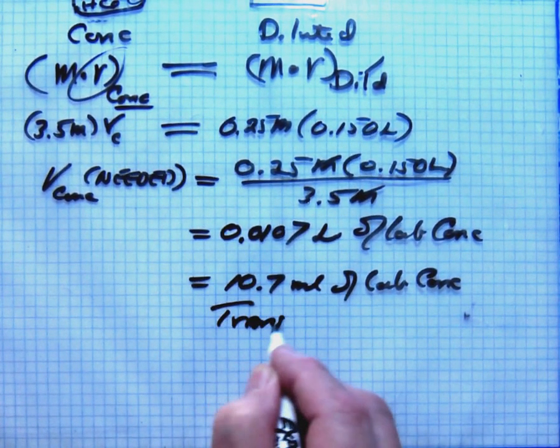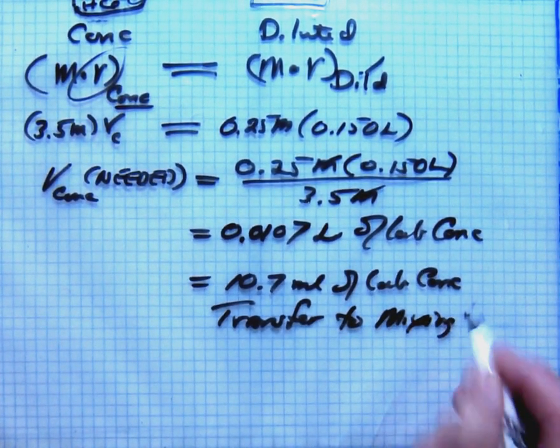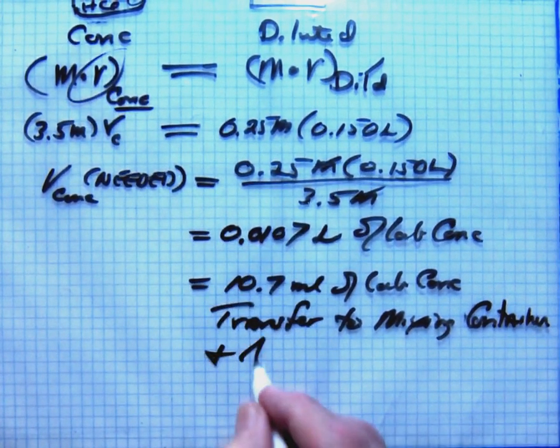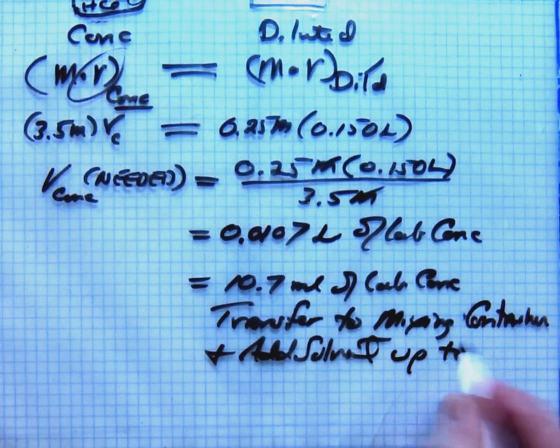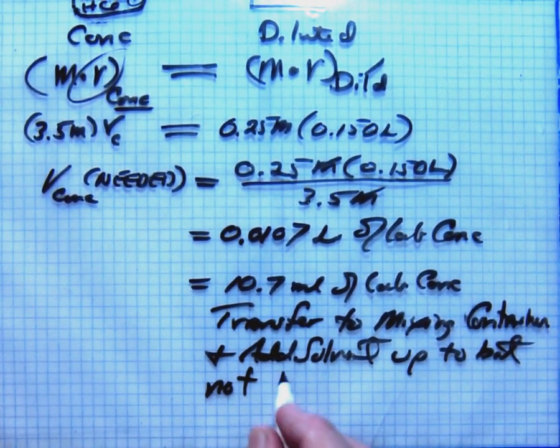Transfer to mixing container and add solvent up to, but not to exceed, 150 mils.